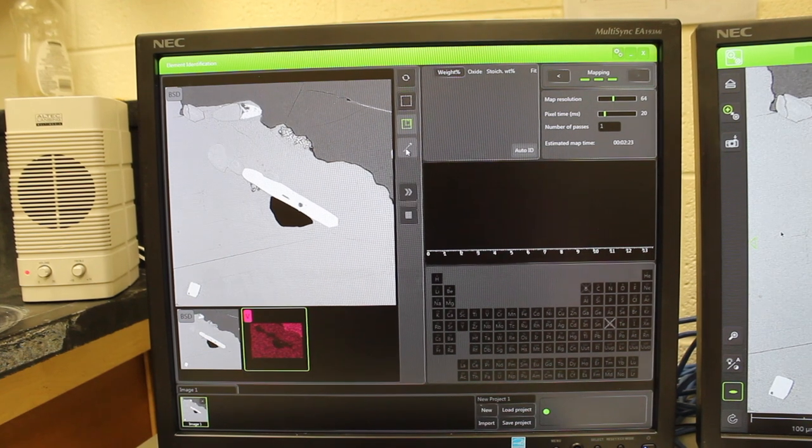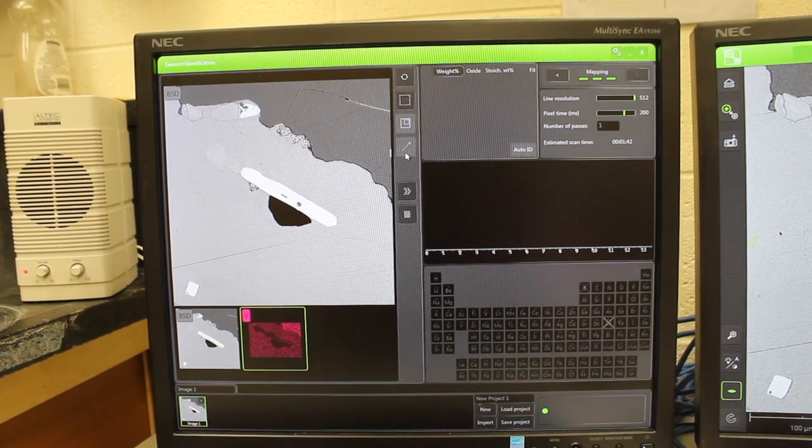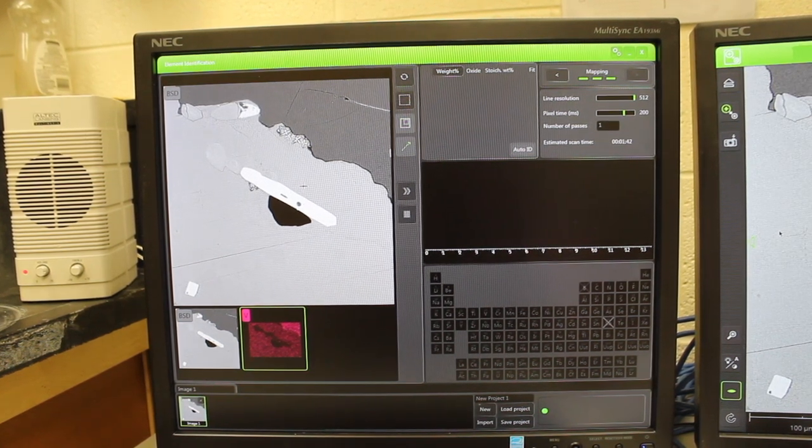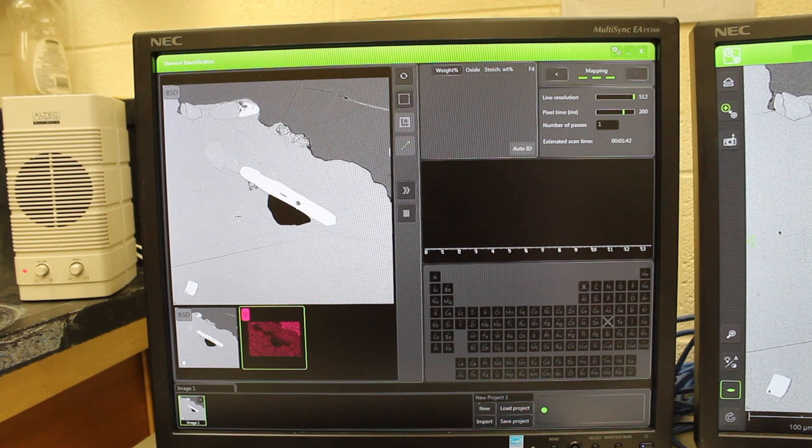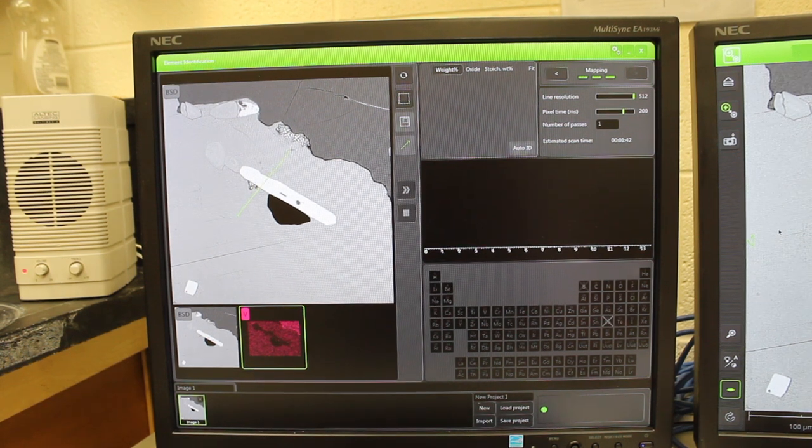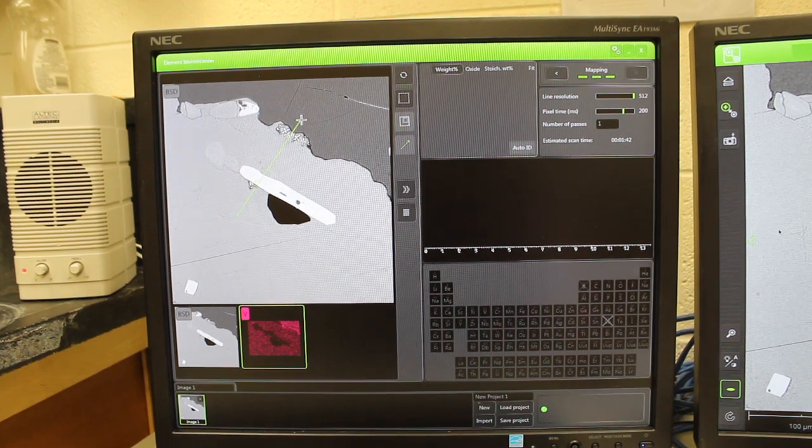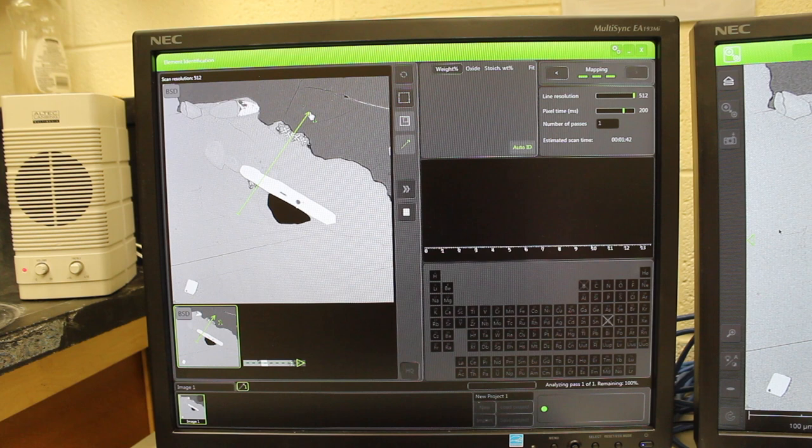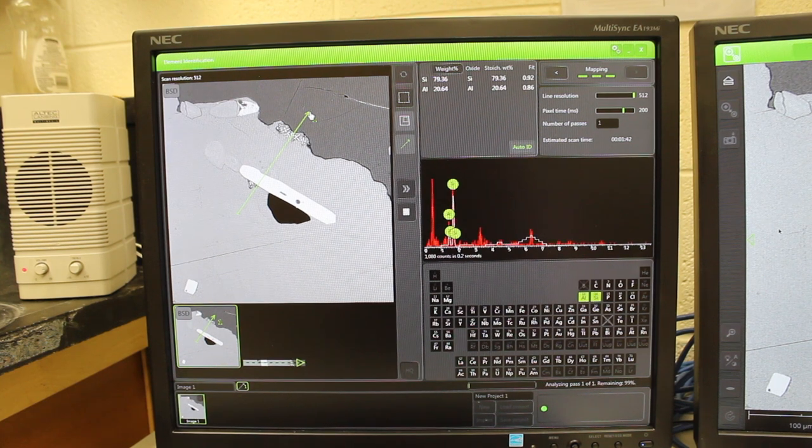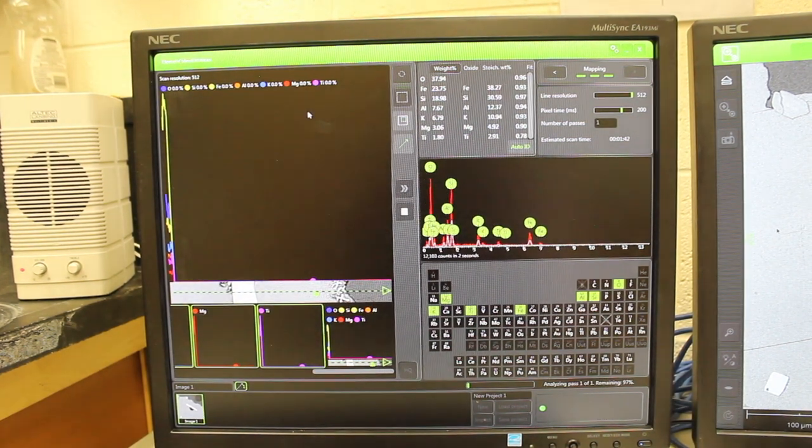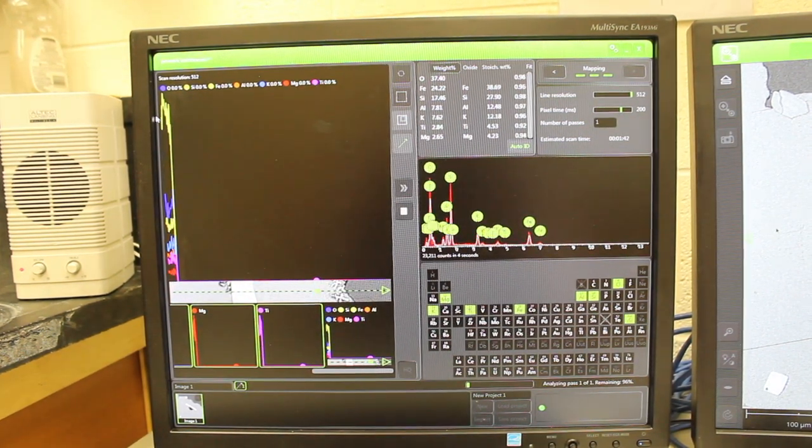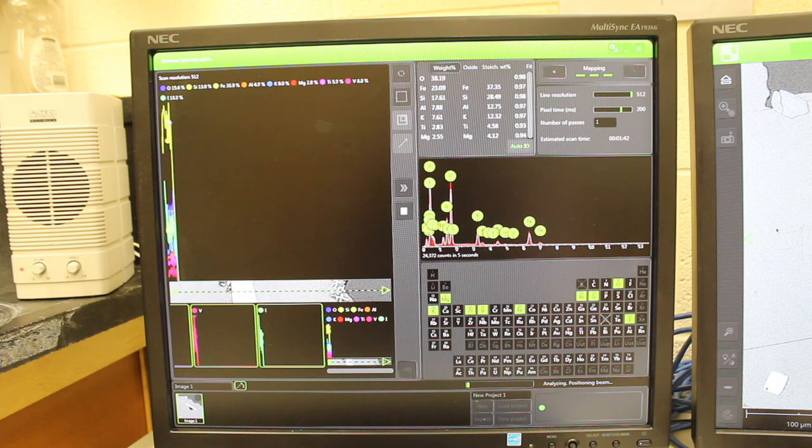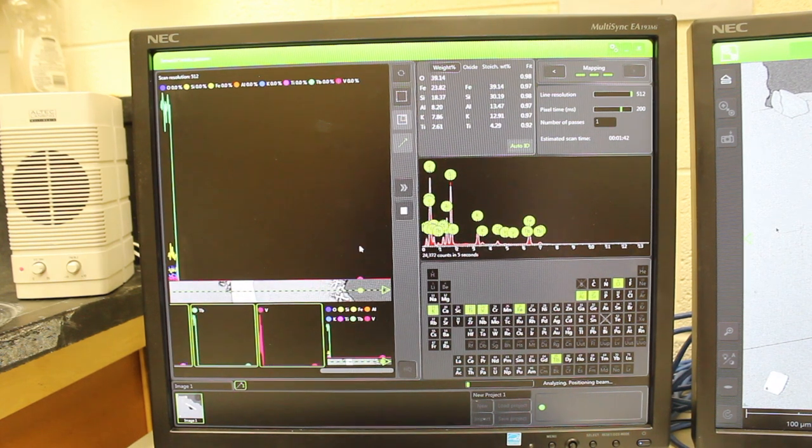To make a transect, just use the transect button here, and then you can draw the cross-section you want to analyze across the sample, and then it will create compositions across that transect.